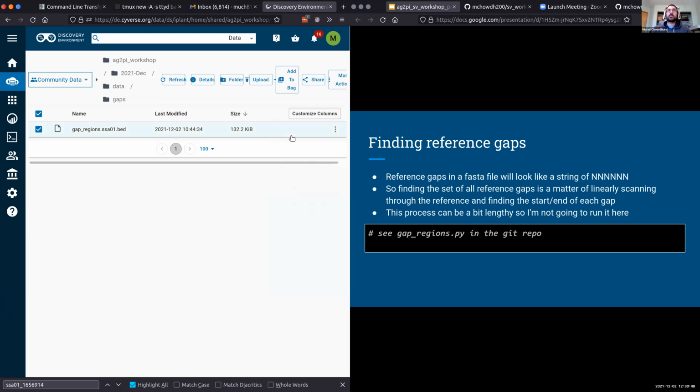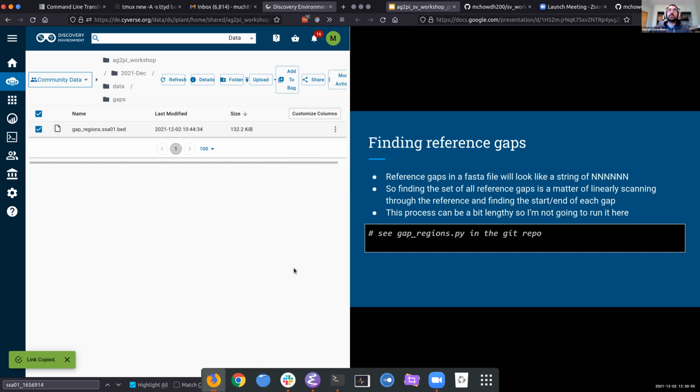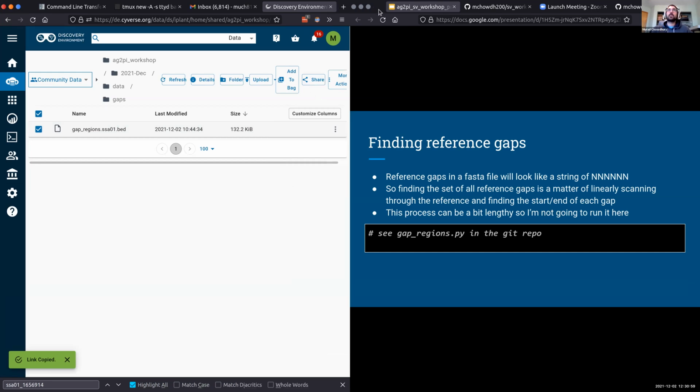So I think that's, well, actually no, copy the path. So basically, let me do the chat. That's possible, or I might just paste it into this slide here. I can't seem to access the chat when I'm sharing. Or perhaps, let's see. Oh, yeah, I can do it. Well, I got it, but just in case. So basically what I'm doing is I'm pasting the path to the data store, and then you basically just use the iget command like you did prior, but with this particular path. All right, so now I've posted it there.